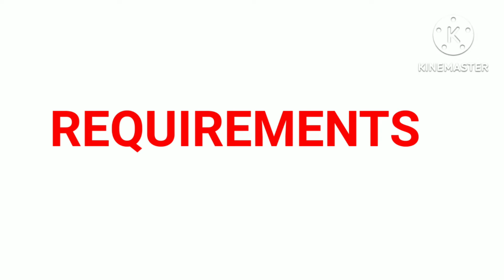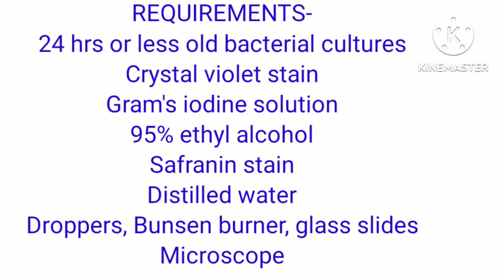Next comes the requirements. The requirements of the experiment are 24 hours or less old bacterial cultures, crystal violet stain, Gram's iodine solution, 95% ethyl alcohol, safranin stain, distilled water, droppers, Bunsen burner, glass slides and microscope.